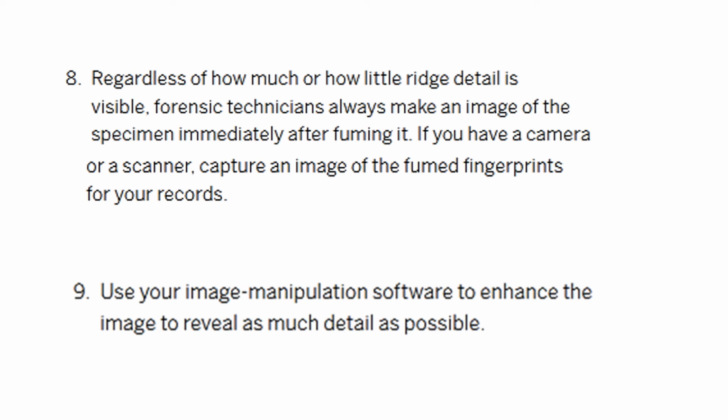Even if the specimen is of very small size, you can magnify it. Capture the images, if you have a camera or a scanner, even of the fumed fingerprints, for our records. Now use image manipulation software to enhance the image to reveal as much detail as possible.